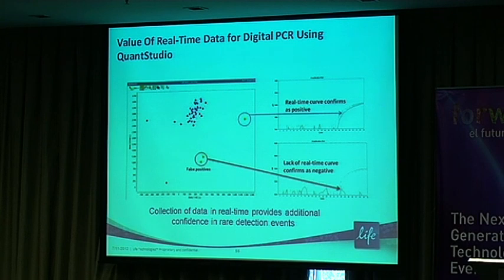Is there something else going on? Was copy number variation present in the actual polymorphism in that locus? And is that what's actually thrown off these clusters? Or is this just a random, spurious amplification event that has absolutely nothing to do with what's really present in my sample?